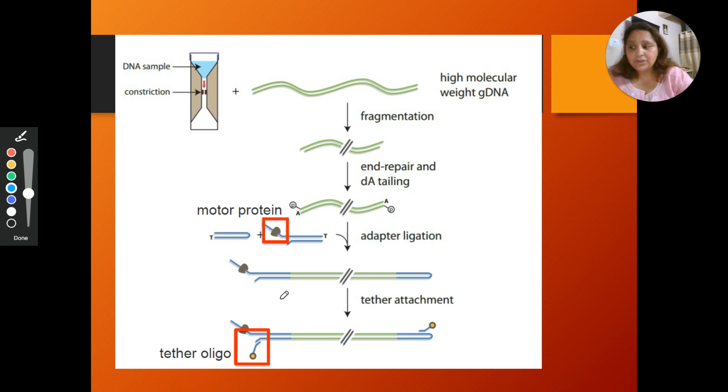Okay. In addition to this, you can see that there is some hairpin-like structure over here, and this hairpin-like structure is added to the other end of the DNA. Okay, and I'll talk about this hairpin-like structure later.